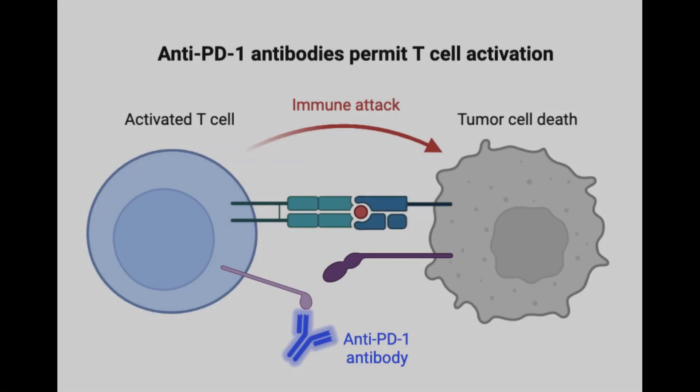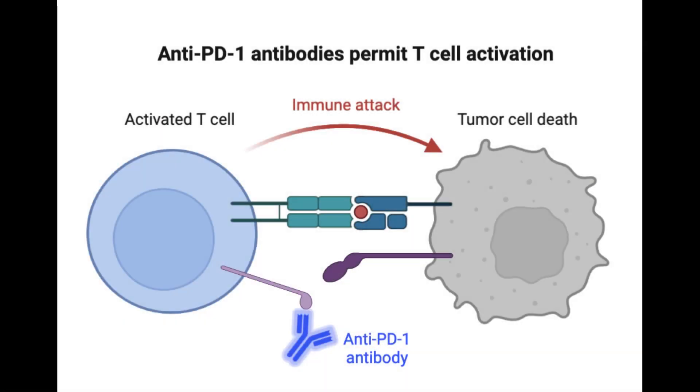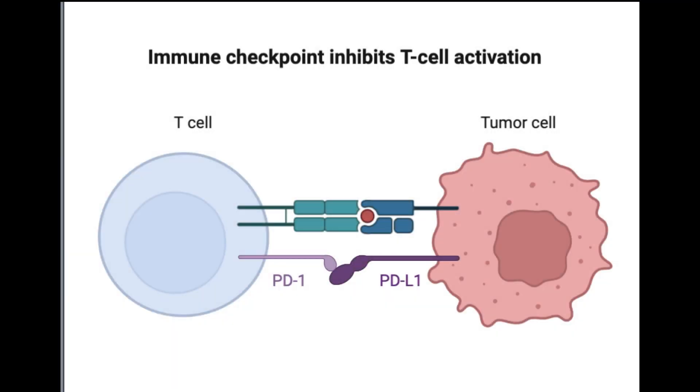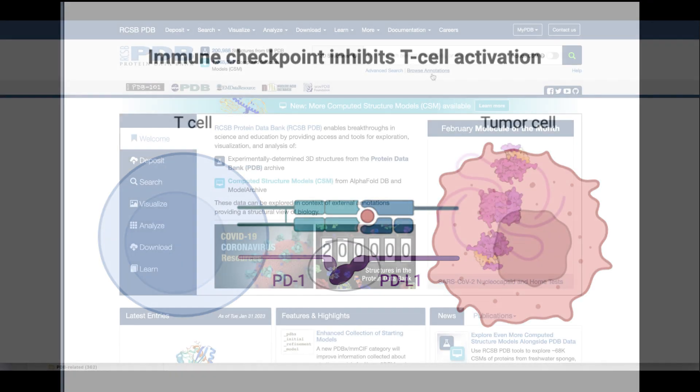This section of the video focuses on understanding how pembrolizumab prevents the binding of PD-1 to PD-L1 during cancer treatment. We will begin by searching for a structure of PD-1 bound to PD-L1.